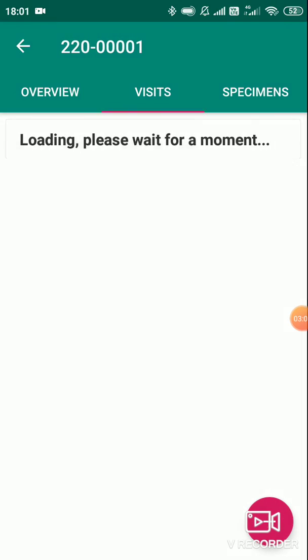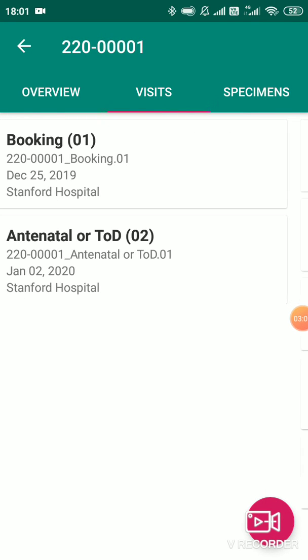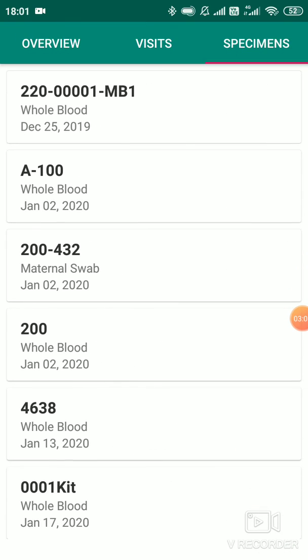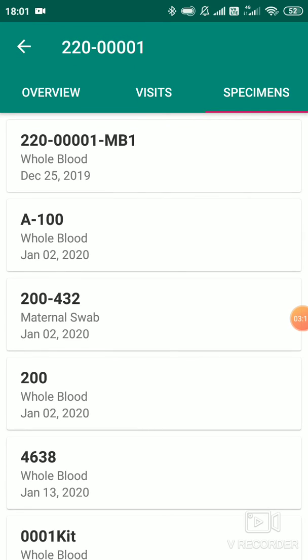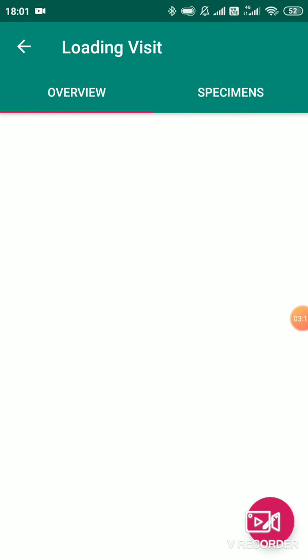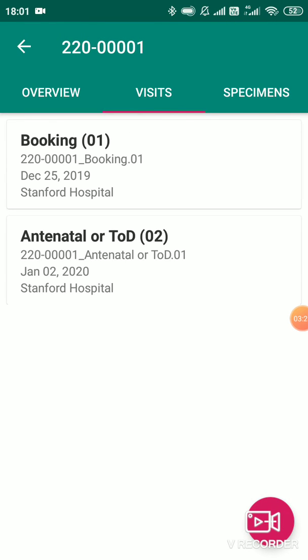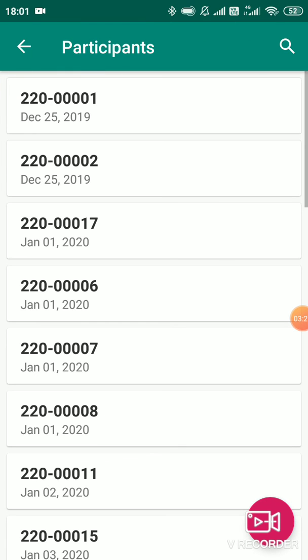Coming back to this page — there is one more specimens page on the right-hand side where you can see all the specimen list across all visits. You cannot add or edit specimens here; if you want to add or edit, you have to go inside the visit and then access the specimens. All these fields are as per client requirement and can be modified — whichever field you want to add on the participant, visit, specimens, and child specimen pages — that is possible.